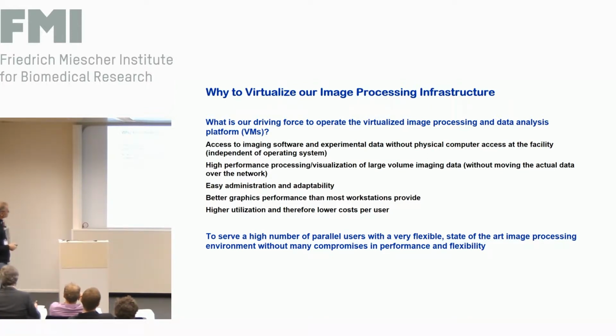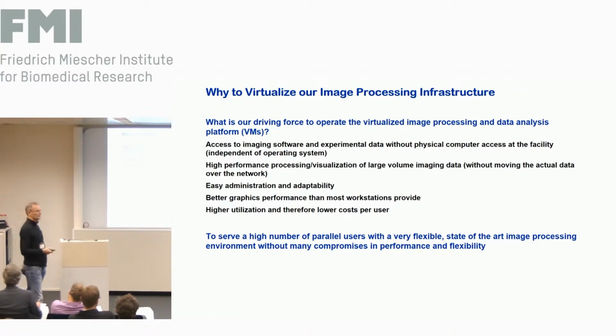So, mainly to visualize the data sets. That's the other thing we realized. A few are doing high content type screening experiments, and they set up their own infrastructure. But the majority was, first of all, looking at the images, and then rendering images. So it's probably 80% of the time people need to do this. So that's what we dealt with. We didn't bother about high content screening, where you may employ different hardware.